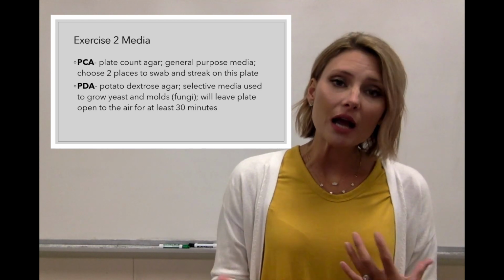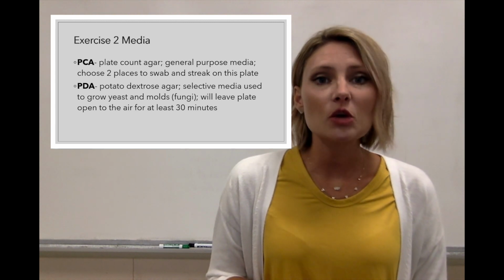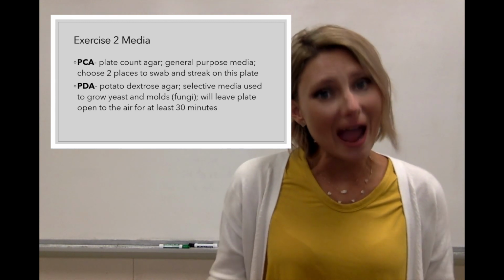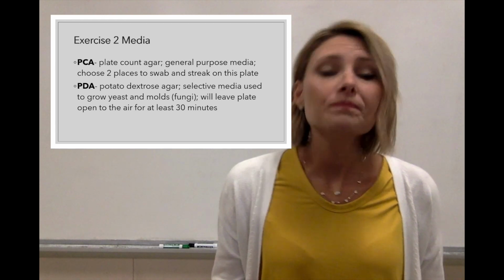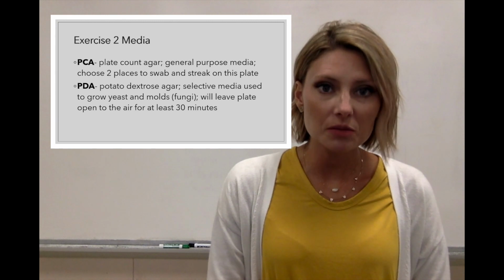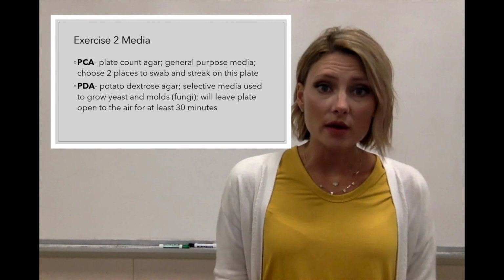So only fungi are going to grow on the PDA plate. And so with the PDA plate, I left a PDA plate out open to the air, and let the air in our lab circulate and touch the top of the plate, and then we are going to look and see what kind of growth we have on our plate. So let's go over to the workbench and do those procedures, and then we'll read the results.